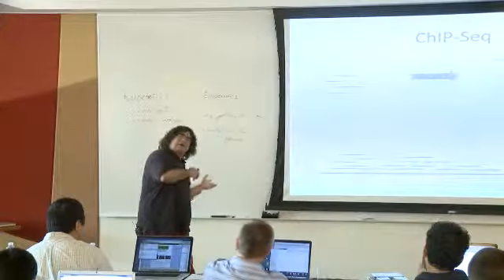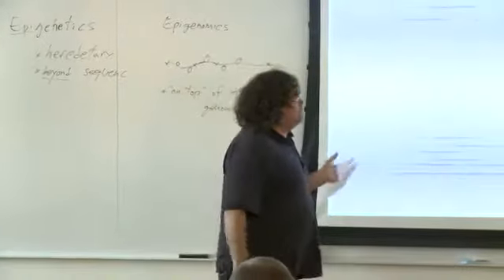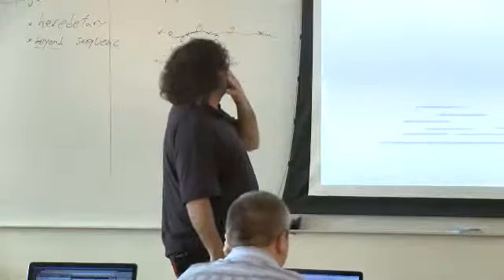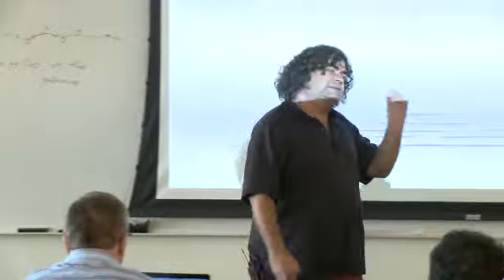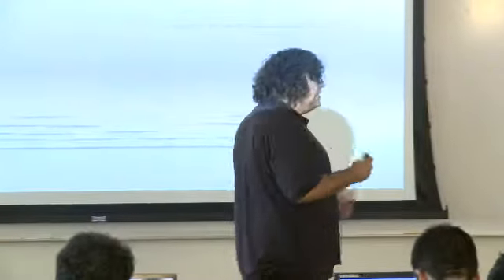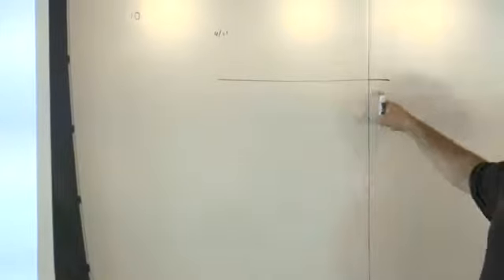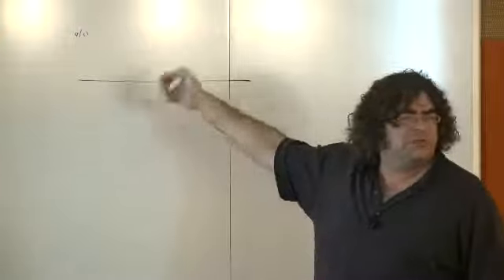If you want, I can spend a little bit of time on this, related to the question that was asked before: single end, 36, 100, paired end. I can say one sentence and then depending on if you want or not, I can say a little bit more. We do 36 base sequencing. Single end, what does that mean? These are DNA fragments that came from the assay. Let me use the board. This is a piece of DNA fragment. It can be 200, 300, it's not completely uniform. Say 200 base pairs long.